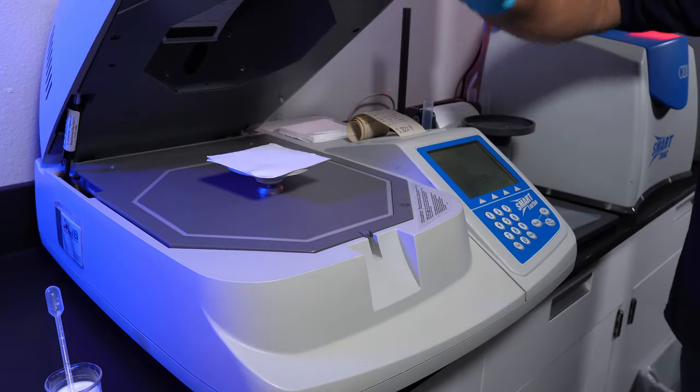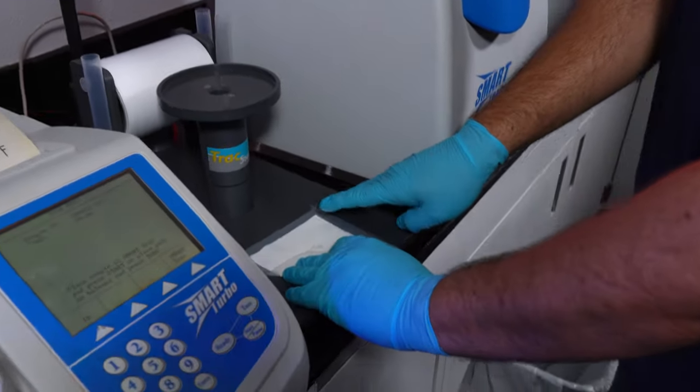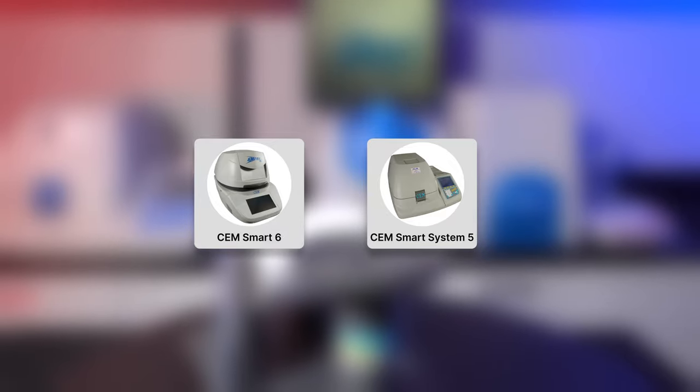This is done through the microwave drying ability mentioned earlier. Other CEM Moisture Solid Analyzers such as the CEM Smart 6 and Smart System 5 can also be used in place of the SmartTurbo.